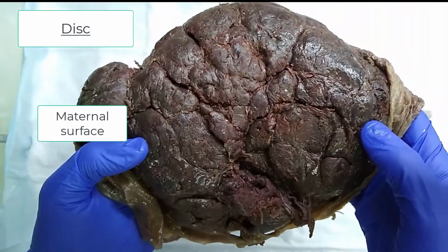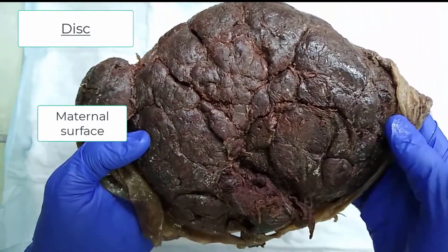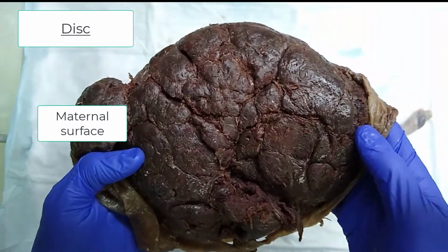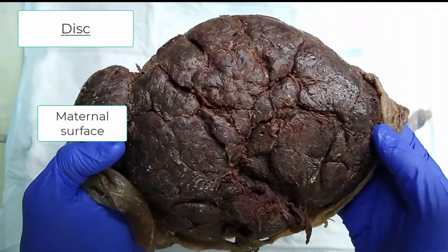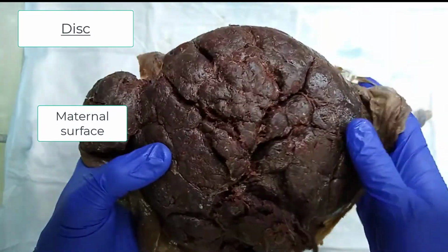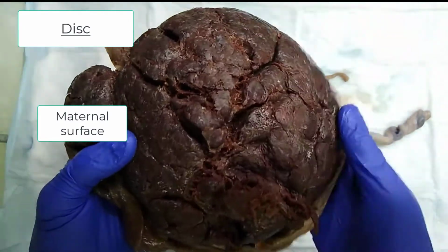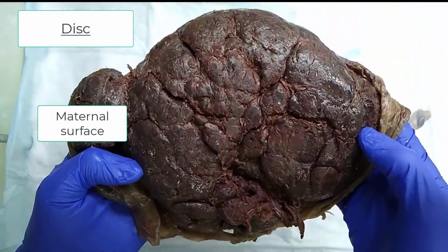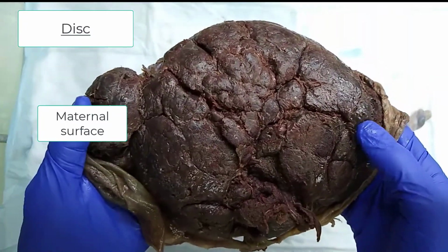But if there is an incomplete surface, then you think about things like accreta, where some of the placenta may still be attached to the uterine wall. The other thing we look for is whether there's any adherent blood clot to the surface of the disc, which may be associated with an abruption.